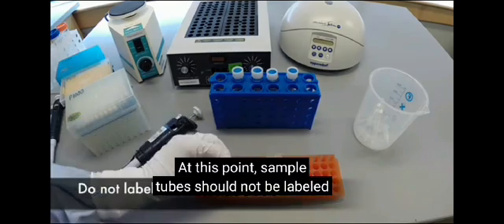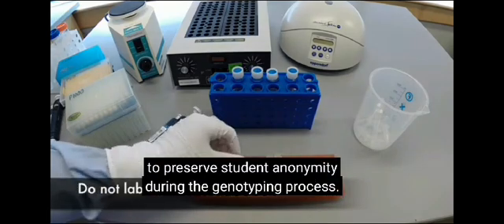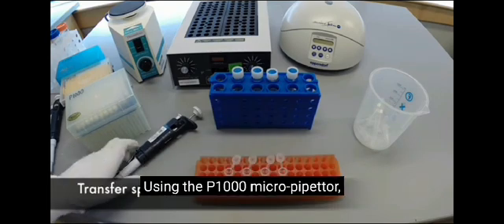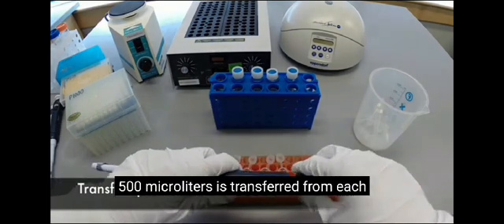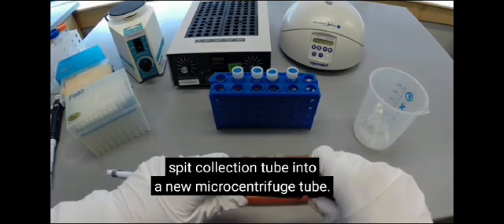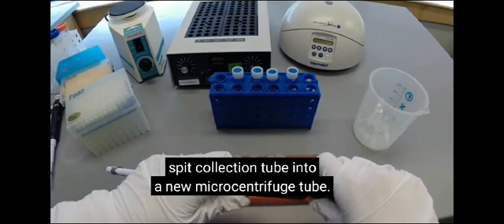At this point, sample tubes should not be labeled to preserve student anonymity during the genotyping process. Using the P1000 micropipetter, 500 microliters is transferred from each spit collection tube into a new microcentrifuge tube.